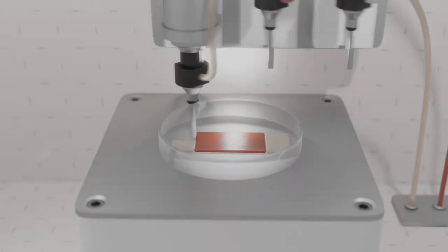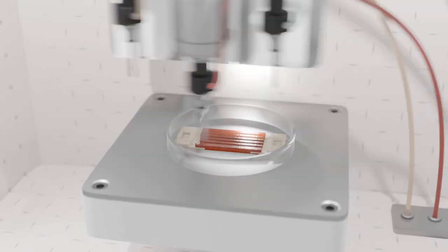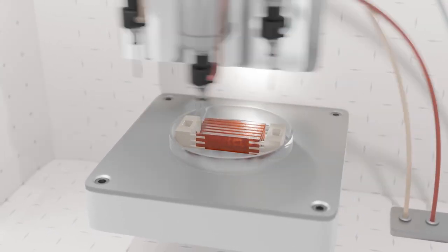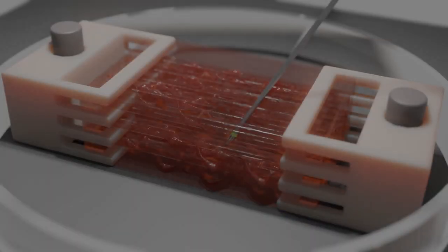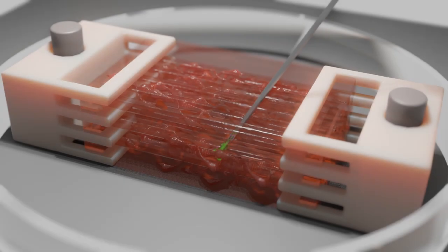With this work, we showed that extrusion-based multi-material bioprinting and bio-hybrid designs can realize skeletal muscle tissue that faithfully mimics the native vascularized muscle tissue architecture and can be used for drug distribution tests.